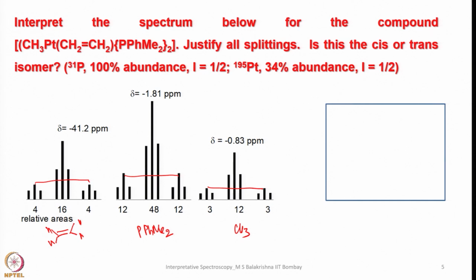So this spectrum is for 1H NMR, and it shows for ethylene a triplet and satellites, and again the methyl group a triplet because two equivalent phosphorus nuclei split it into a triplet, and again satellites, and again the methyl group's satellites. Okay, so no doubt this is a 1H NMR spectrum. So this is how one can analyze and interpret the data. So let's move on to other examples here.